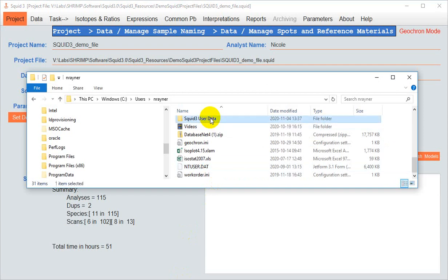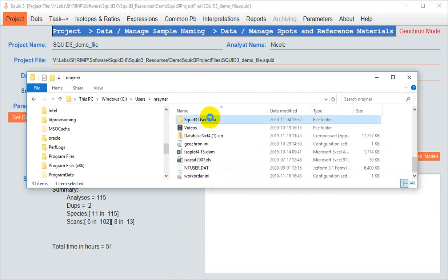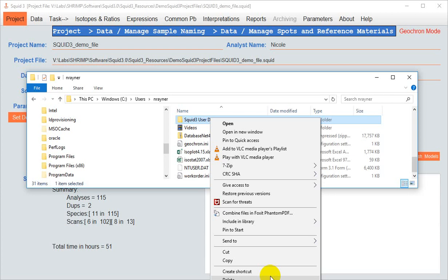The next time you launch SQUID, it will recreate this folder, and the built-in models will remain there. Then you can start importing just the ones that you want.